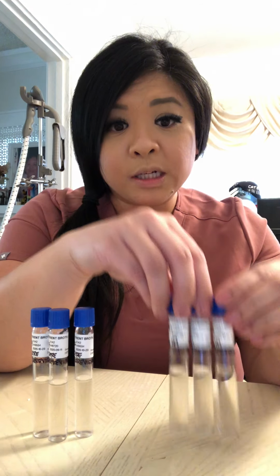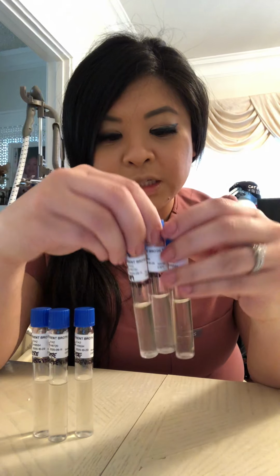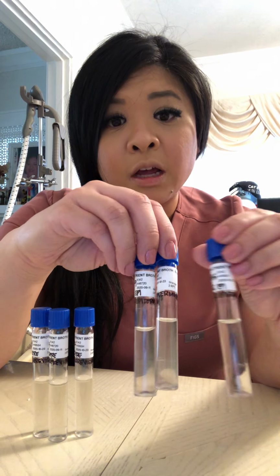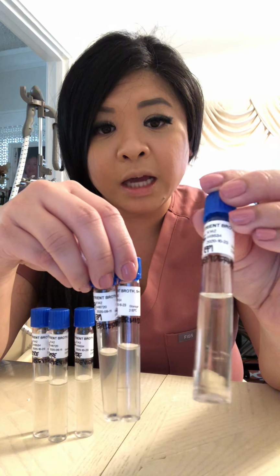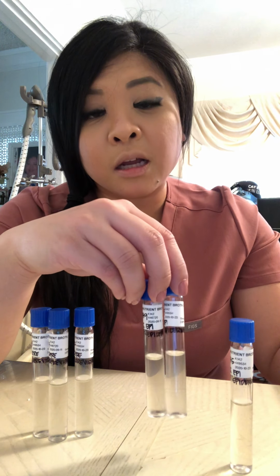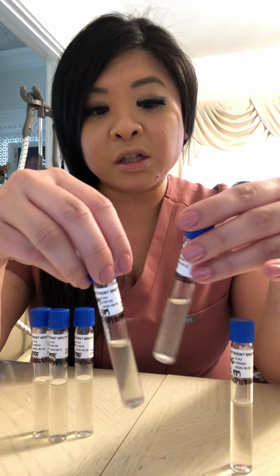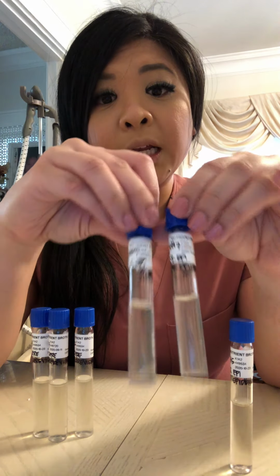For my S. epidermidis vials, for whatever reason, and I'm not sure if the S. epidermidis culture I have in my refrigerator is no longer potent, my pH of 5 came back clear, or negative, which indicates that according to this result, S. epidermidis does not grow in a pH of 5. But my pH of 7 and 9 are turbid, meaning that S. epidermidis grows in a pH of 7 and 9.